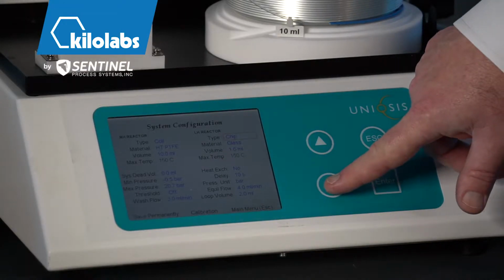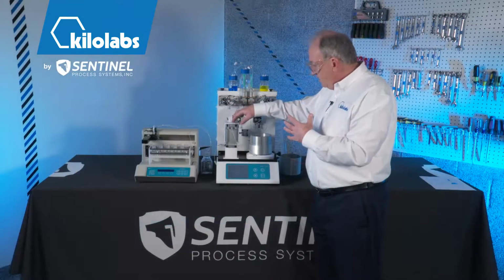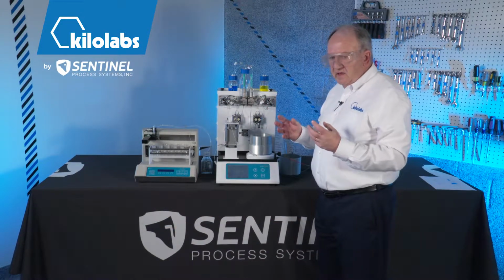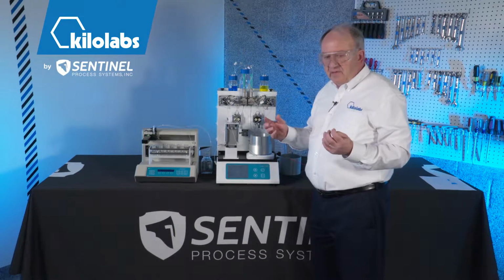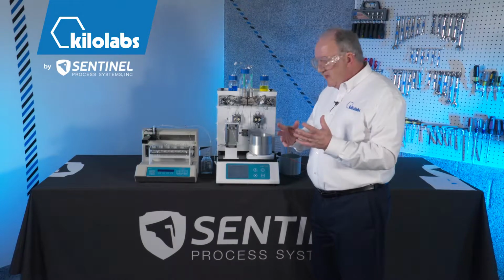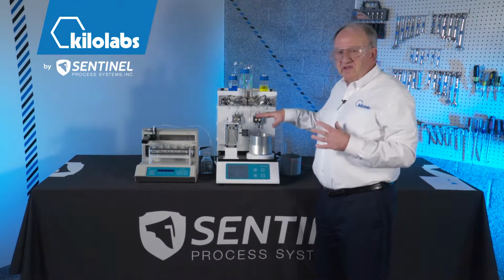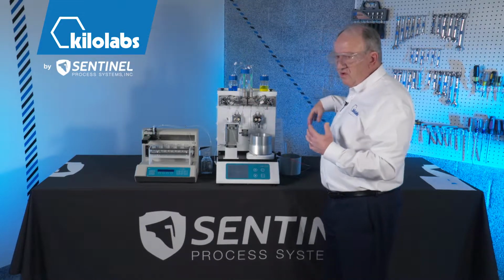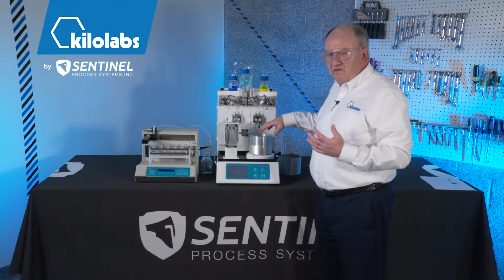Now, as I said, the way this is configured is we have a mixing chip feeding the coil. The reason we do that is we want the reagents to be mixed intimately through the static mixer, and in essence enable the fluids to flow through and be mixed before they go into the residence time of the coil. You can set this up in ways so that you don't have to go mixing chip to a coil. You could do several coils in sequence. You could have much larger mixing chips. These could be run under refrigeration.